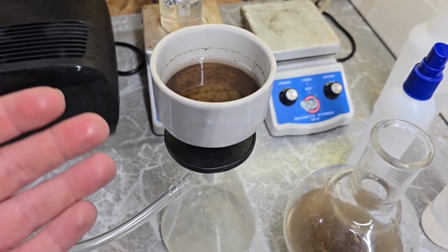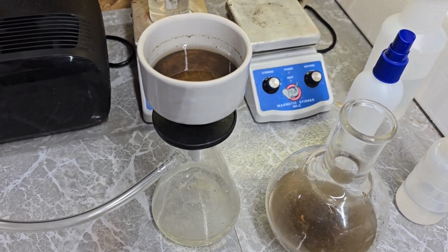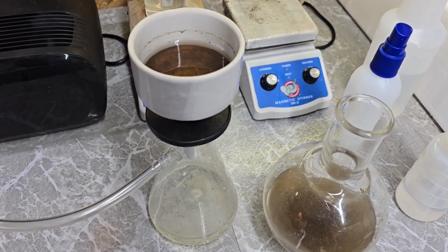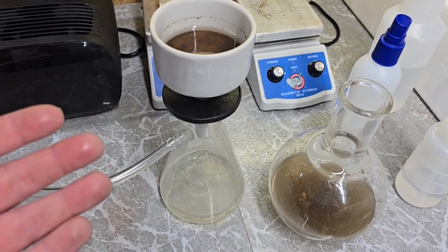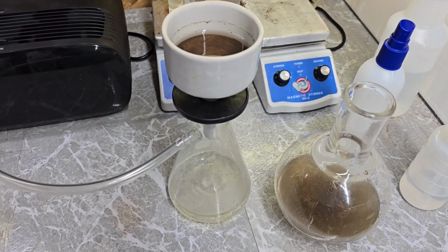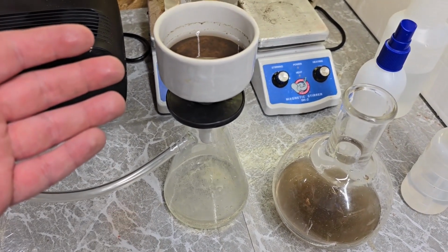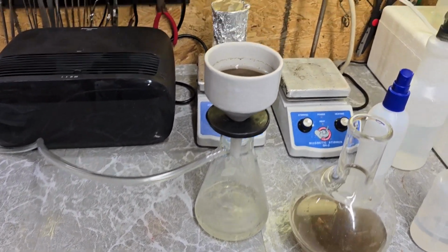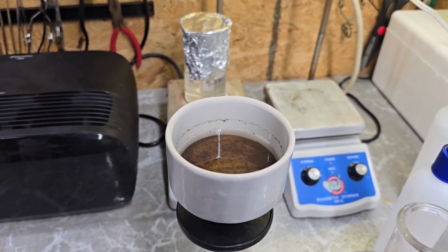This is why I hate vacuum filtrations with stuff like this, because these filter papers get clogged up so easily, and then it just takes forever for them to go through. It does this even with my actual vacuum pump. This cheap one that I'm using isn't the problem. This is still this slow whenever I'm filtering stuff like this out. So let me do that, because I have officially run out of patience.